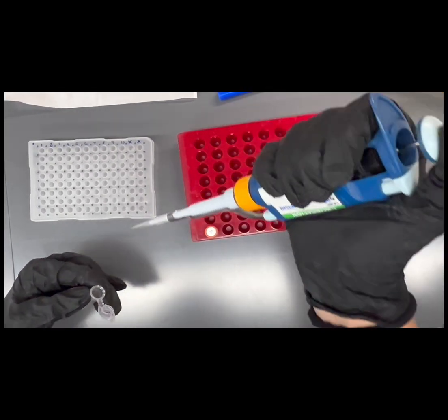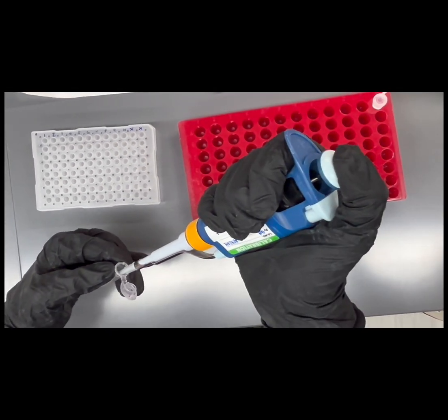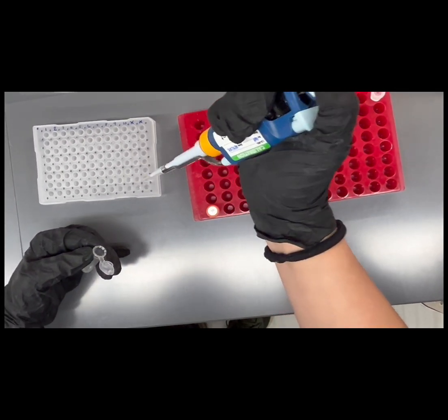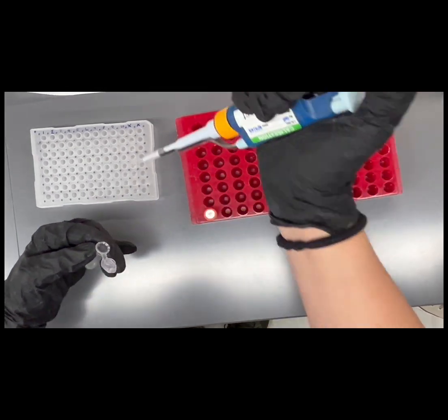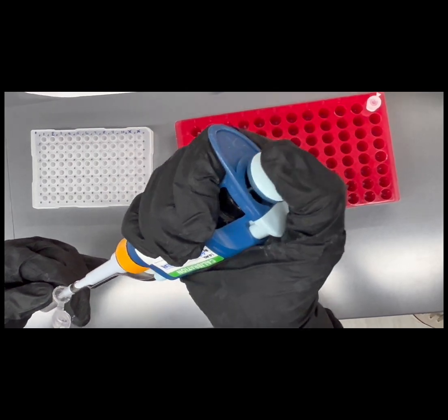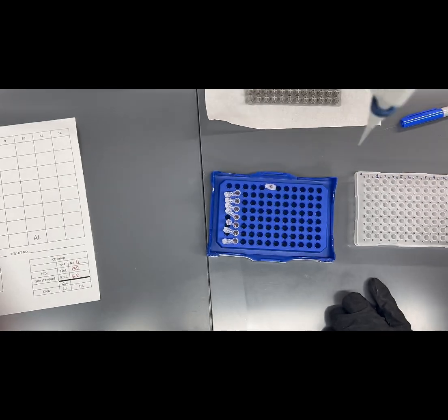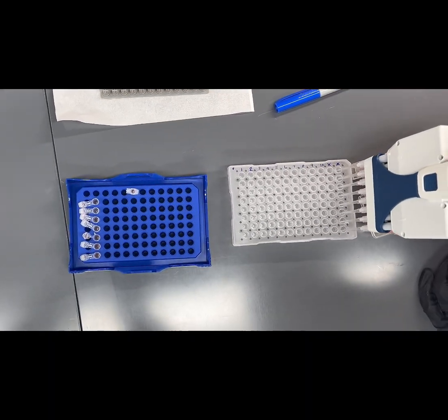The allelic ladder is an artificial mix of all possible alleles at each of the target STRs and is used to automatically assign fragments by their specific alleles. It is important, though, that the allelic ladder is not added to the wells with our sample's STR fragments, as this would interfere with interpretation by masking or overshadowing the true alleles present in the sample.